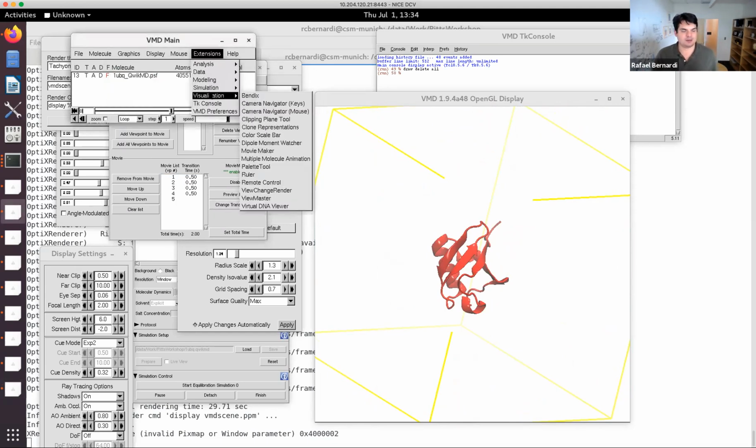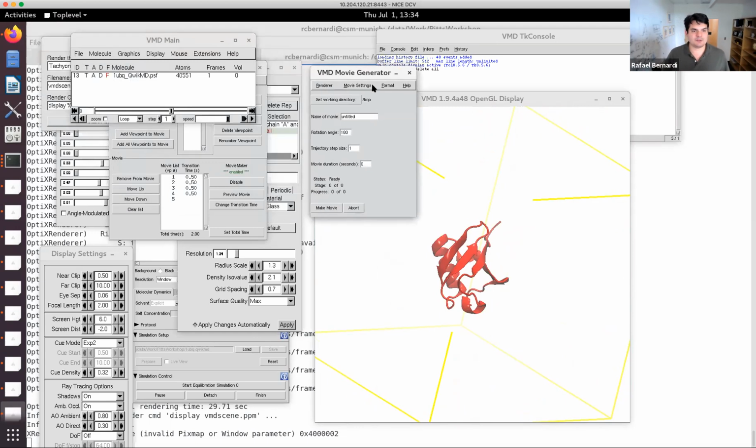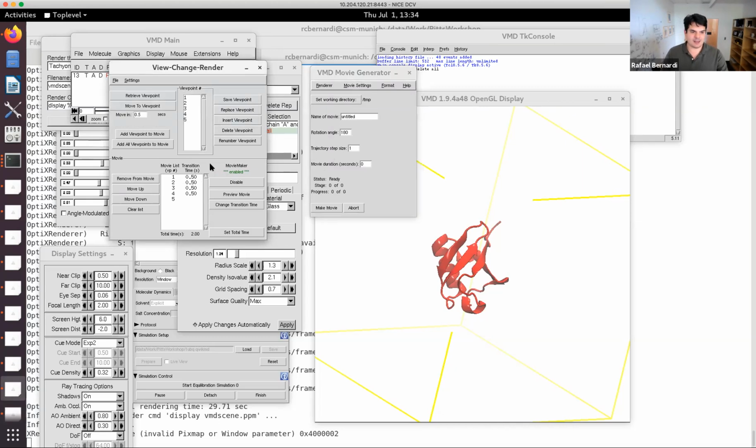Then you can come here in the visualization, take the movie maker, and instead of using the rock and roll trajectory, you can use user defined procedure. The user defined procedure is what you define here, so you're going to use whatever you define in this step. That's enabled now here for Movie Maker. It's going to be your steps here. So when I render this video now, it's going to render exactly what was created here, and then you can generate these different angles and different views, and then you start combining things.